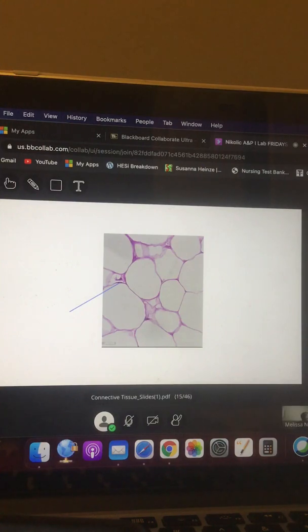When I look at this image on page 44, I would go to the very right, and it looks kind of like the tip of a pencil, that adipocyte that has ground substance to the right and left, and then that dark part at the bottom of it. Do you see what I'm saying? The pointy one? Yes, exactly, the pointy one. So it kind of looks like this, and then there's ground substance here, and then I would go with that, right? Just like that.